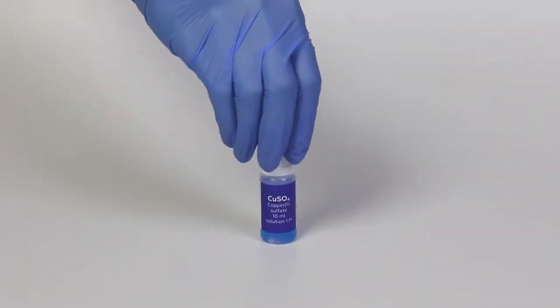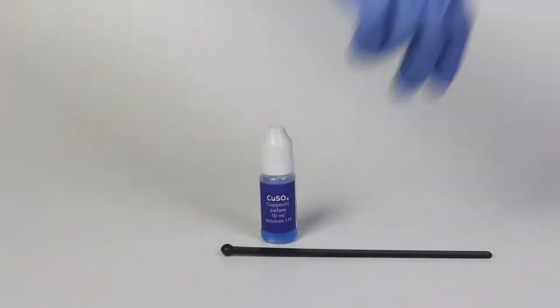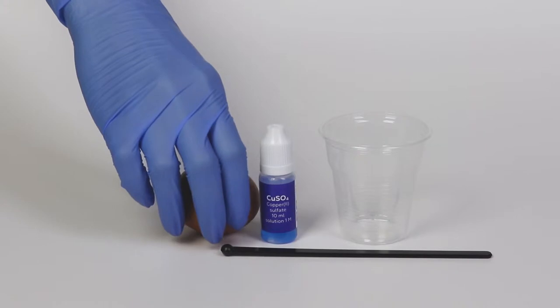For the protein slime experiment, you will need the copper sulfate solution and a plastic stirring rod. From the starter kit, you will need a disposable cup. You will also need an egg and a napkin or paper towel.